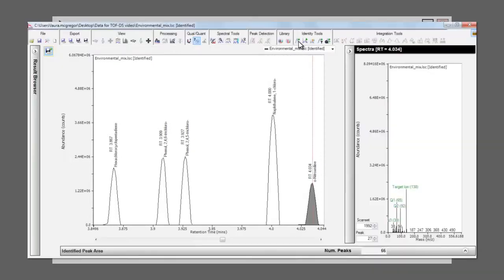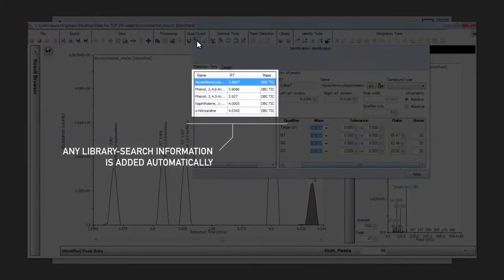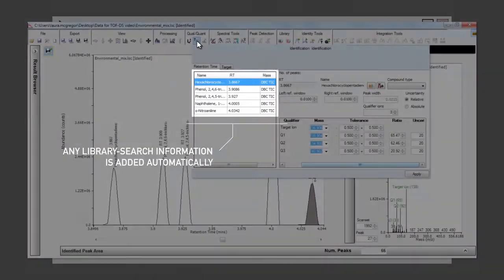When this is done, they appear in the table of target retention times, and any information that has already been applied to the peak, such as the top hit in a library search, is automatically transferred across.